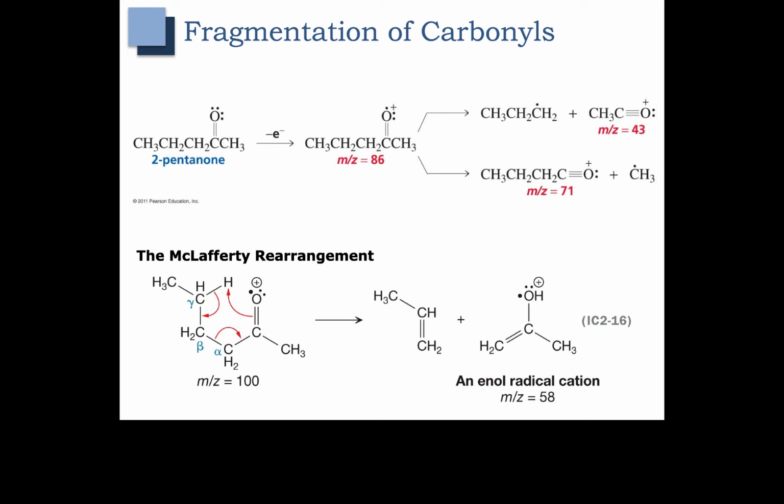The take-home message really, though, for carbonyls is that we're going to see a peak representing the carbonyl and everything on the left, and a peak representing the carbonyl and everything on the right. We also see the McLafferty rearrangement peak, but it's not super significant, and the most important ones are the two that we have listed up here.